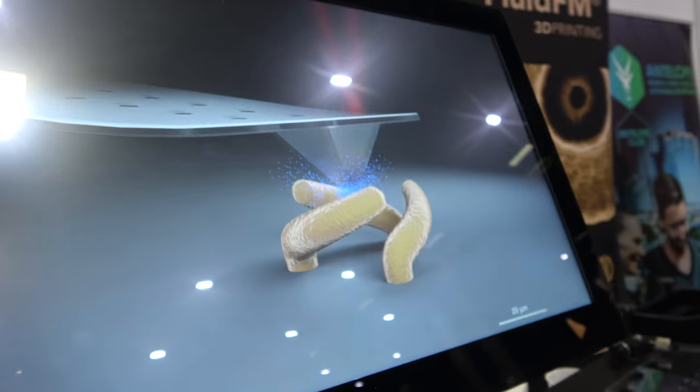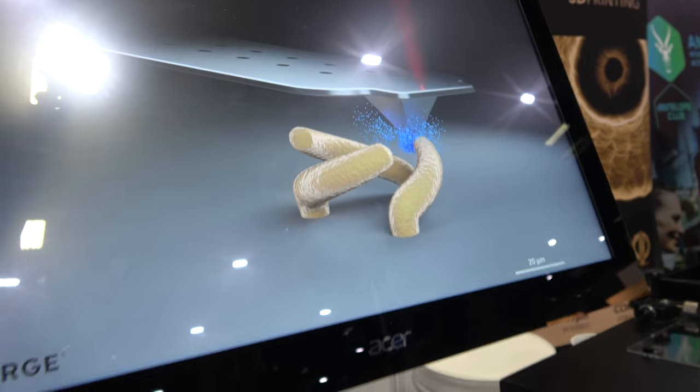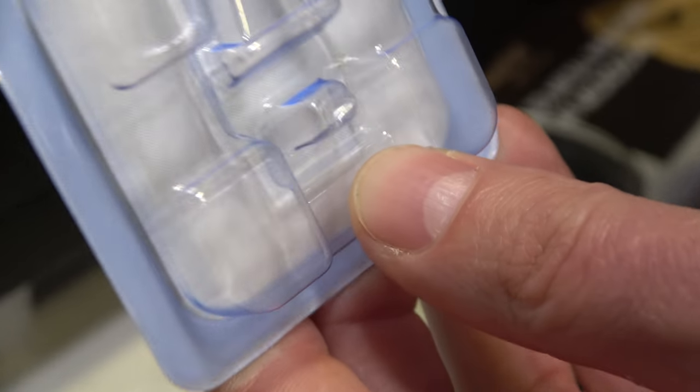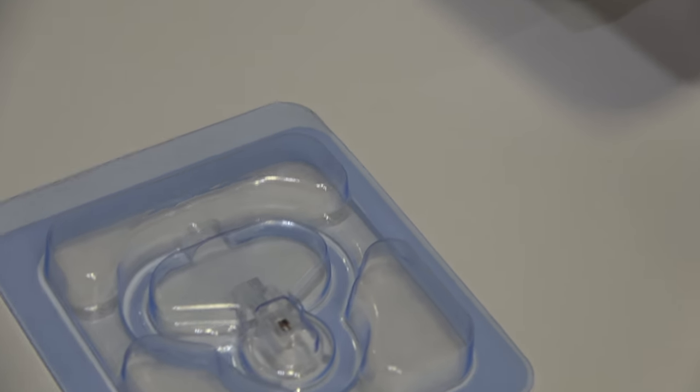And can you tell me a bit more about what you have here? Basically these are the tips — these are the print heads. It's very consumer friendly. I'm going to show you on this one.